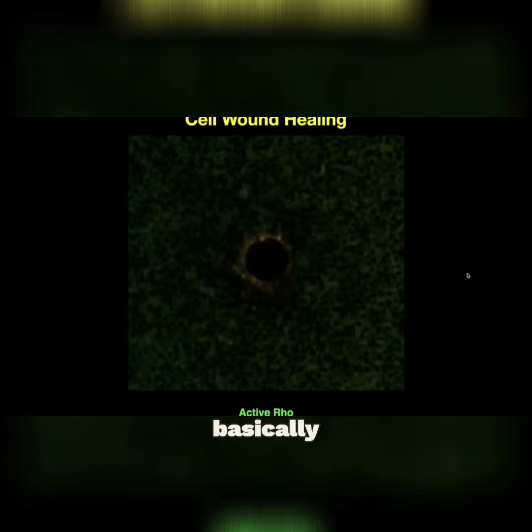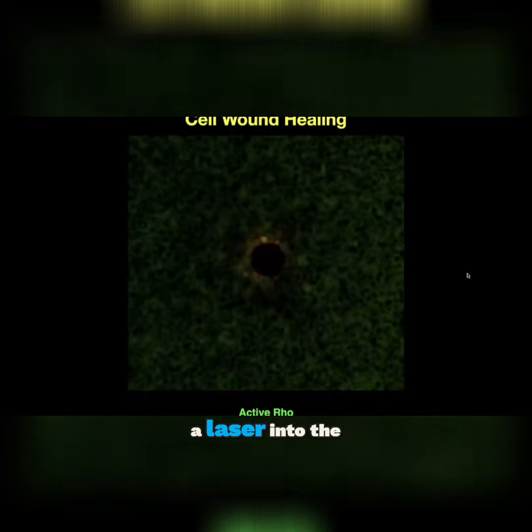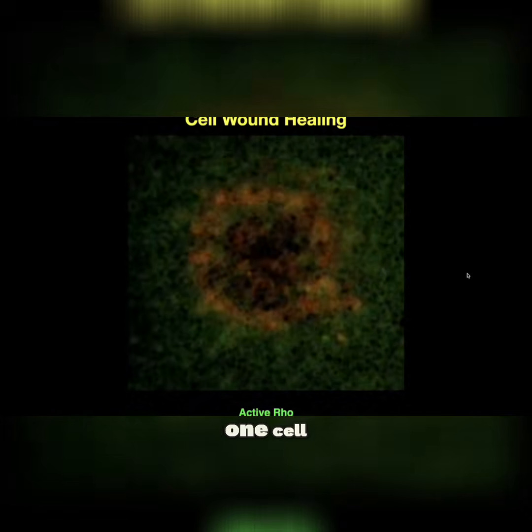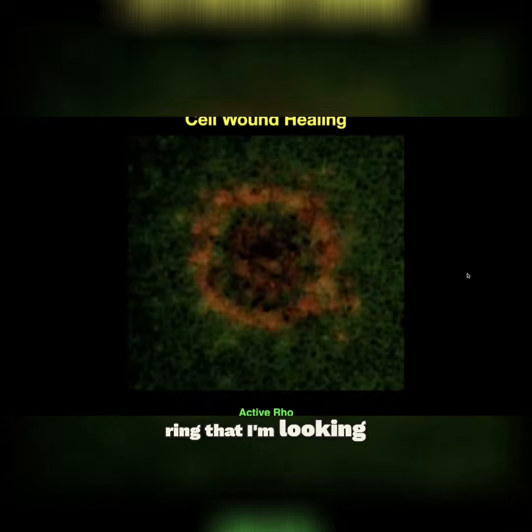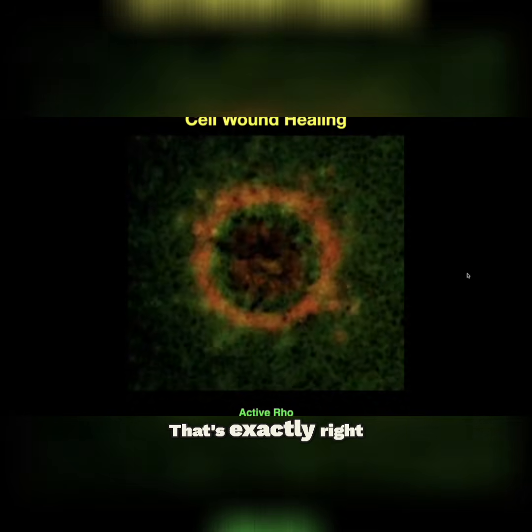So basically, in this experiment, we're looking at a cell, we start filming it, and then we fire a laser into the cell to create the wound, and then we watch the response as it happens. Wow. So we're looking at one cell, and the center of the ring that I'm looking at would be where you've blasted a hole into it with a little laser. That's exactly right.